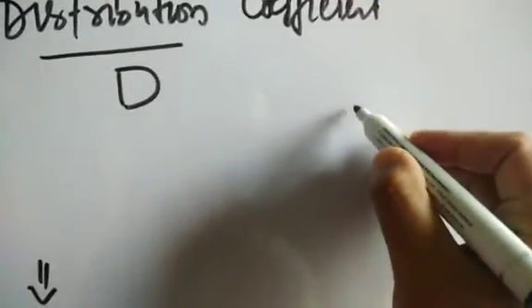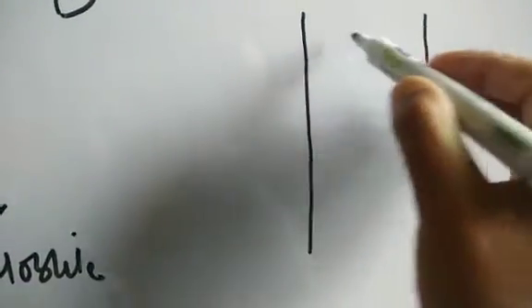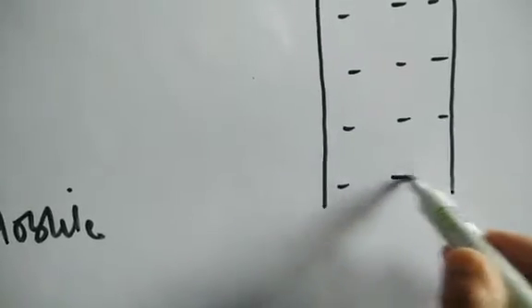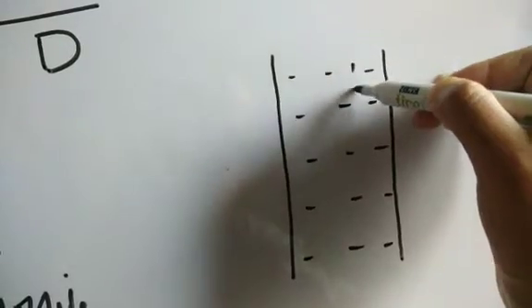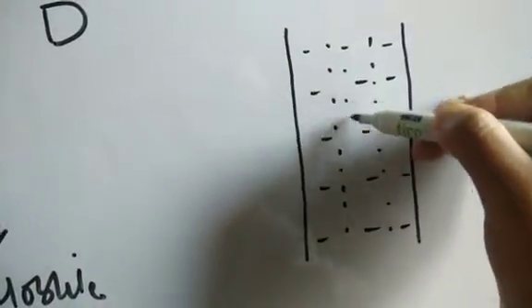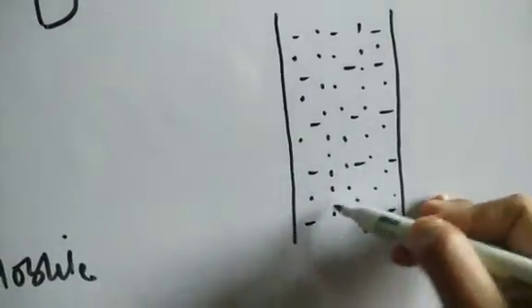Okay. Now basically what is partition coefficient? As we said, in all chromatographic systems we need to imagine an image: we have a column that's packed with stationary phase. Let us say it's solid here, fine, and then we are pouring our mobile phase. Let us say this is our mobile phase. So the mobile phase is flowing in this direction. So these dots are mobile phase.